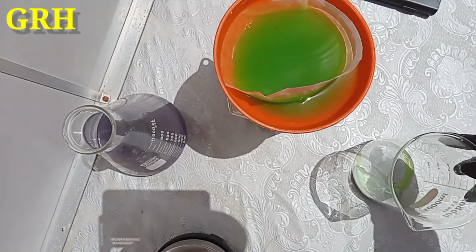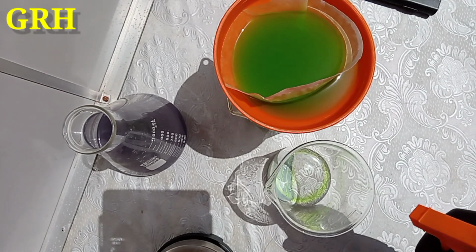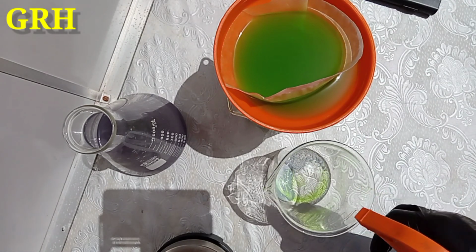Then wash it several times, and leave it a few moments in the sun in order to change color from white to gray.